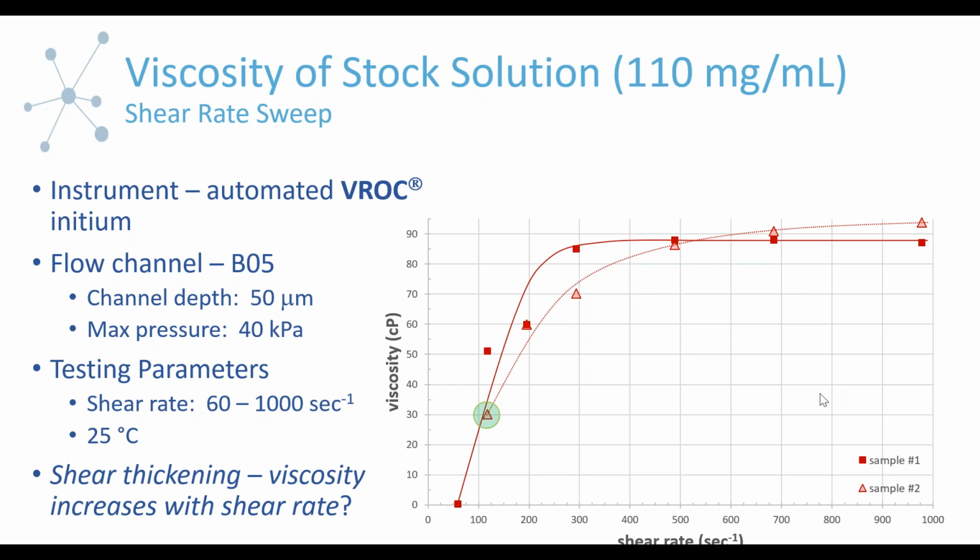And so this is quite unusual, viscosity increasing with shear rate, referred to as shear thickening. It does happen, but it's not something that happens as commonly as, say, shear thinning. So to me, this is something that I wanted to look into in some more detail. And then also factor in that we're looking at basically a homopolymer at moderate concentrations at low to moderate shear rates. There's nothing extreme here, so it seemed like it would be a good idea to look in more detail at what's happening in the system.